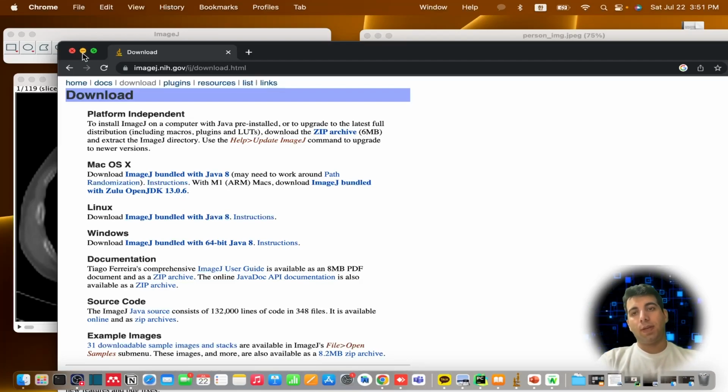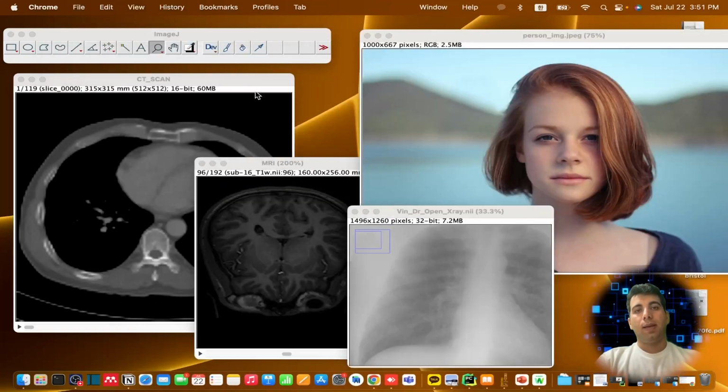I have been with image analysis tools for quite a long time, and I've been using a lot of them. As you know, sometimes in order to process images, you need to understand and visualize your result. I know you can do that using Python, but for some of the basic tasks, you may not need to write a few lines of code to do the analysis. So for simple measurement, for annotation, for writing text on top of your image, or just viewing different types of images, you can use ImageJ. It's portable, just download it and use it.